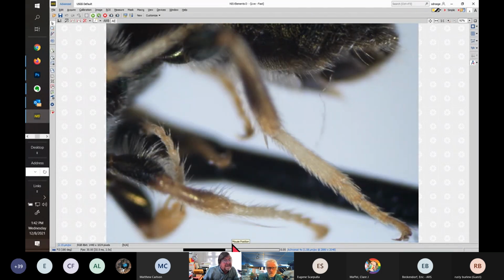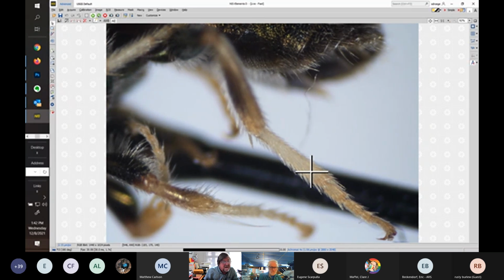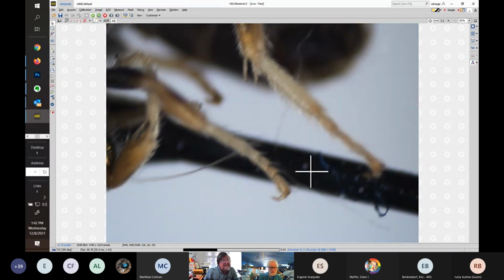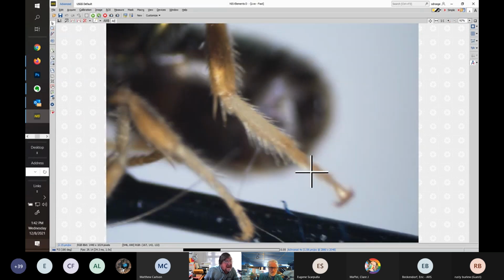All right, so here is persimillis. And I do think that sometimes they do have a lighter, whiter leg. That one does for sure, yeah. But here I may have to orient this a little bit differently. Most people will not see that as being very different from aurata in that viewpoint. There you go.